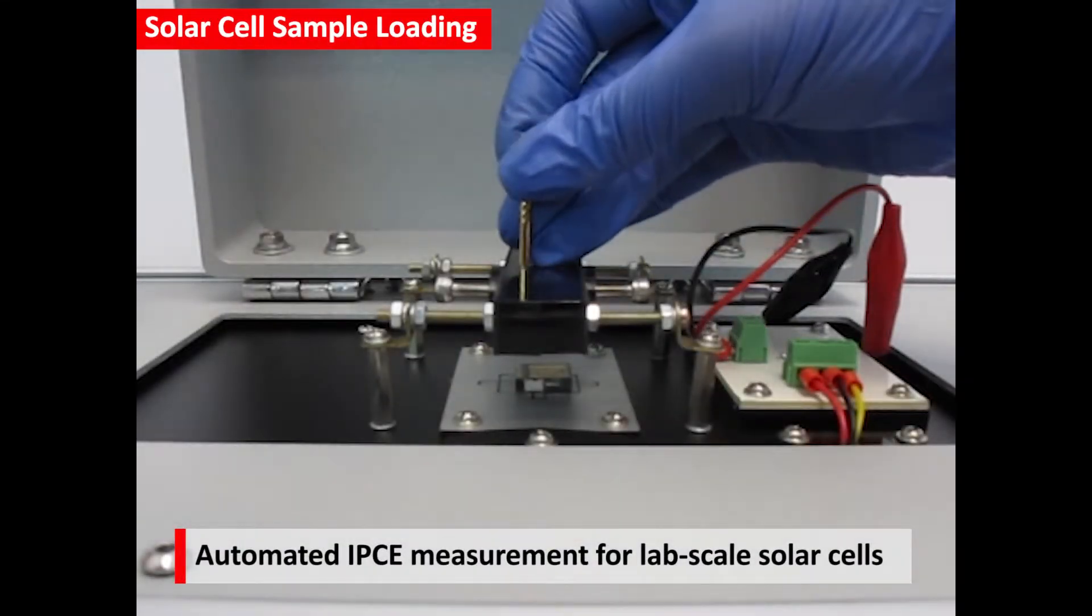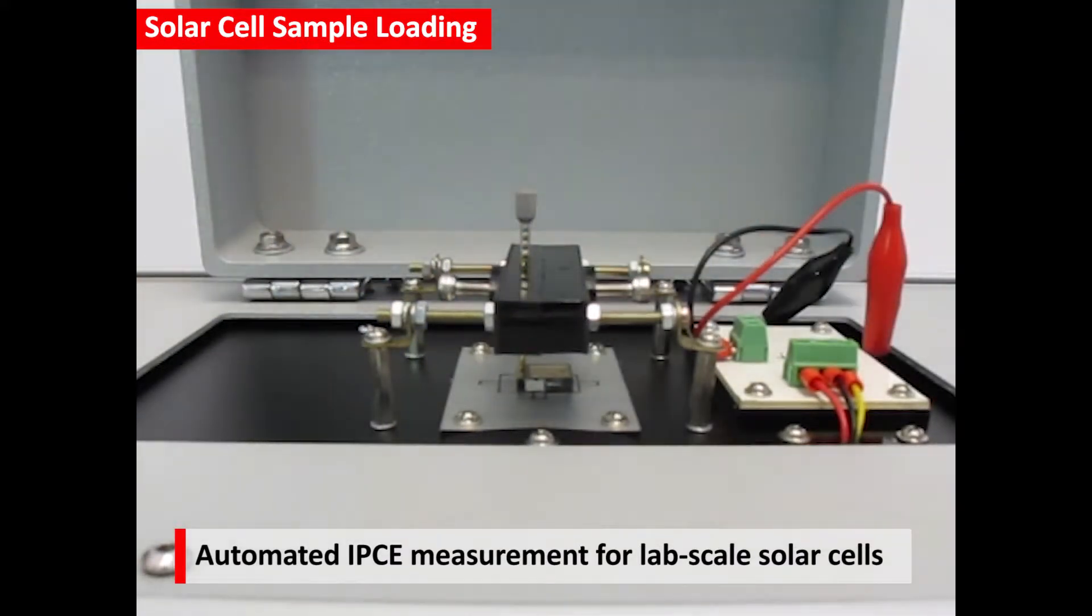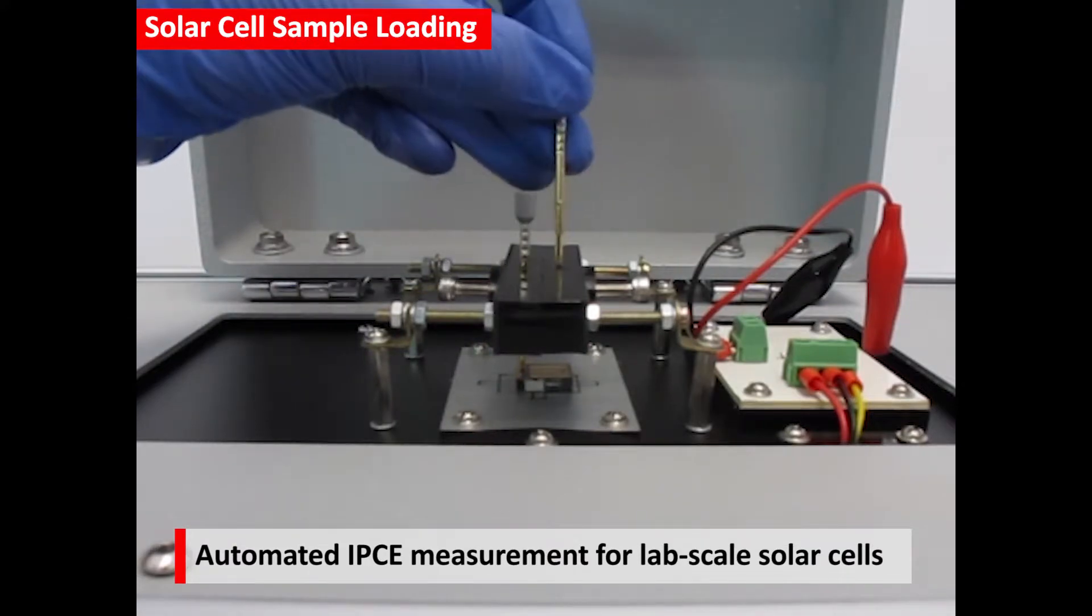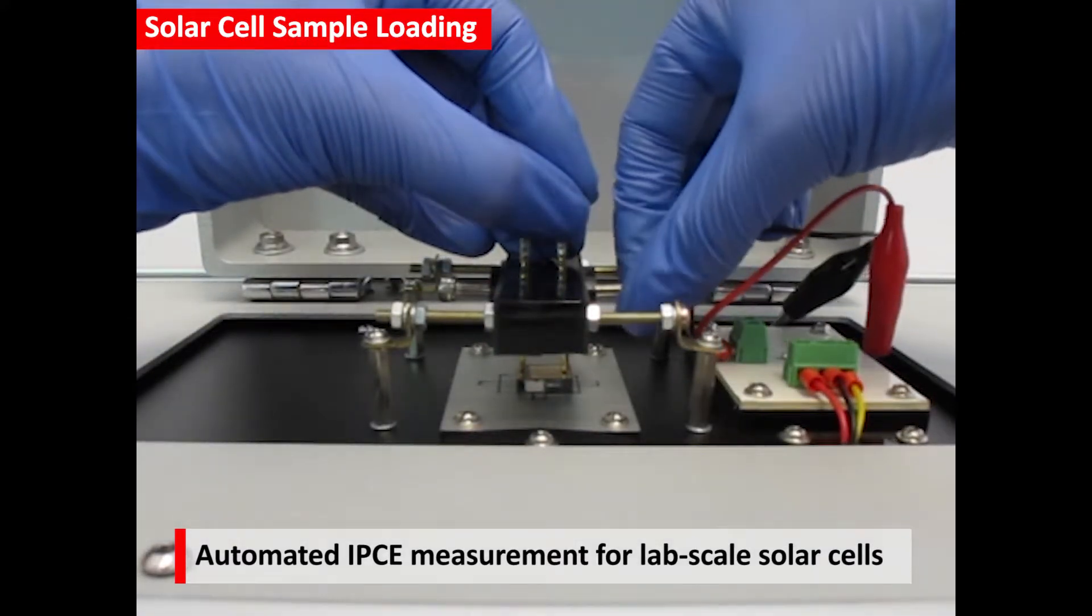Now, the solar cell sample is placed at the sample position, and two spring tips are inserted to make contacts. You can use any other method of contacting to sample cells, depending on the geometry of your cell.